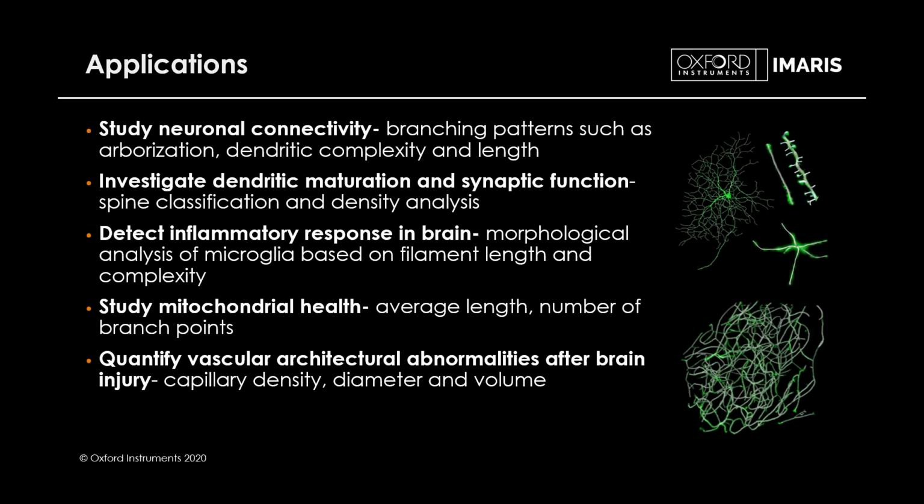Of course, this is not an exhaustive list of applications, as this model can be applied to a wide spectrum of scientific questions. So that being said, I would like to conclude my PowerPoint presentation. And what I would like to do right now is to share my screen, where I have already opened Imaris, where we can start looking at the first example.